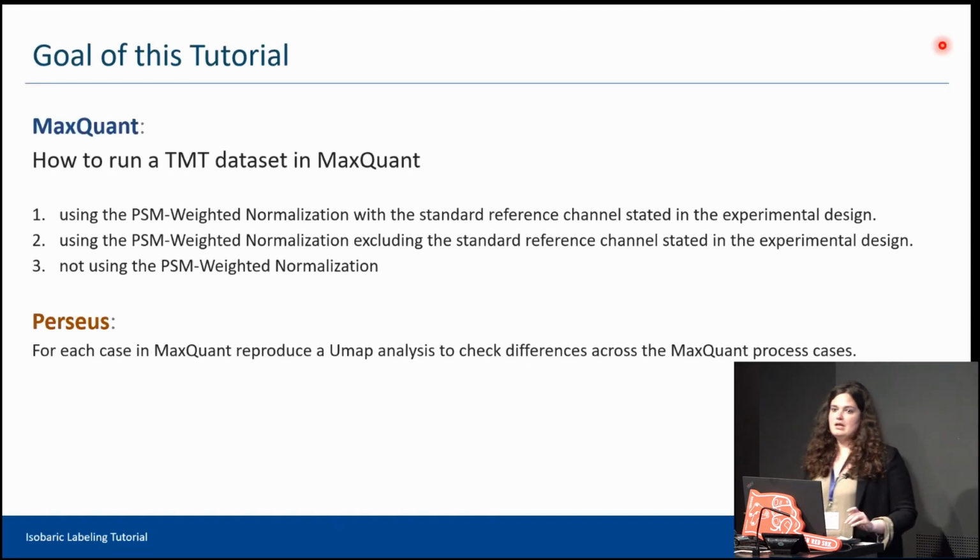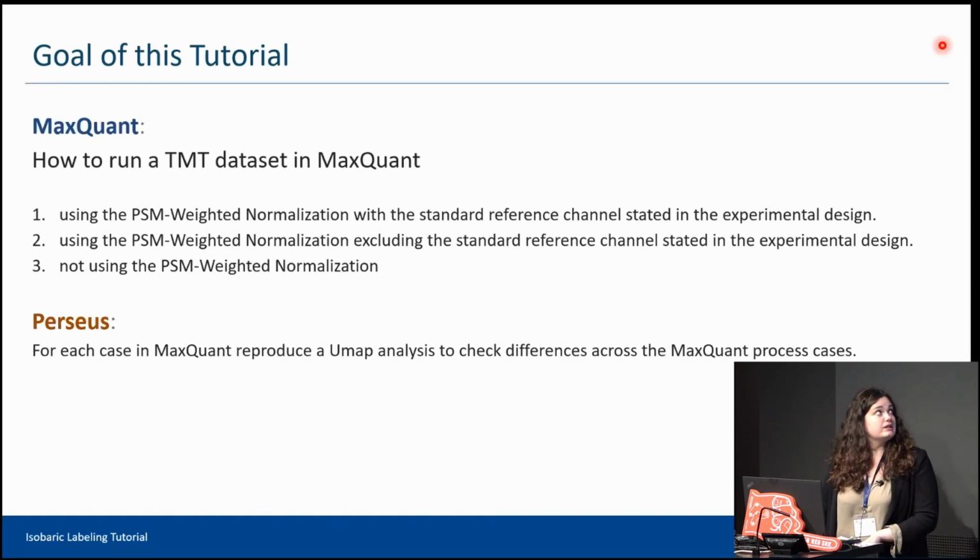It means that, let's say that you have a TMT Plex and the last channel is the reference channel. You will tell MaxQuant that that one is the reference channel. And this is option 1 that I listed here.